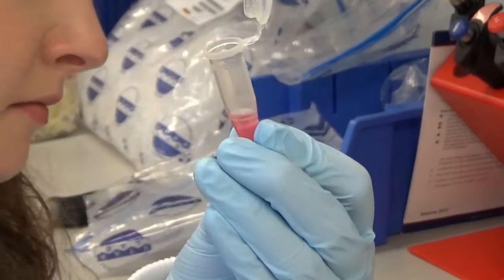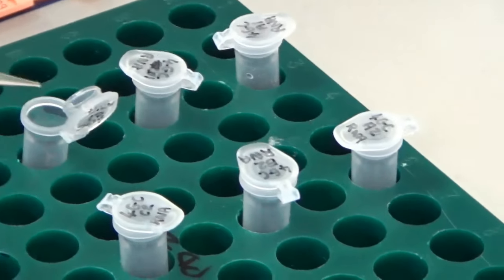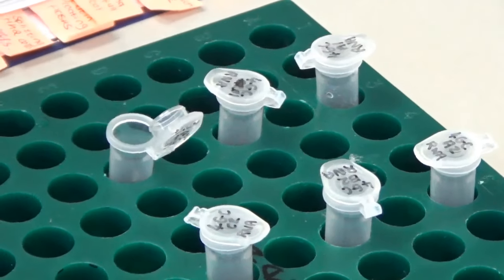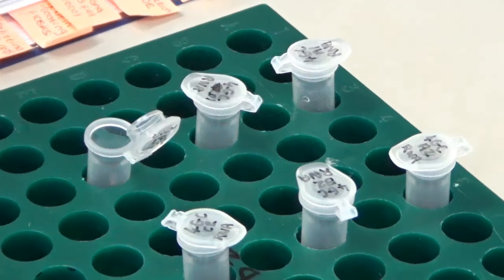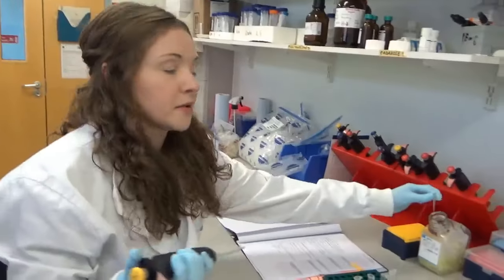Like I said, these are from kidney cells that I've grown up, and I've treated them with glucose and TNF-alpha, so they're both things that you'd find in a sort of diabetic kidney. So I'm going to see how that influences the microRNAs that they send out, basically.